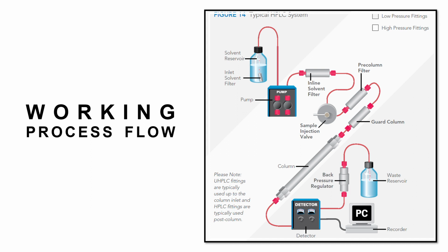The sample injector then introduces a standard solution or sample solution into the mobile phase. Temperature fluctuations can affect the separation of the compounds in the column, so the column is placed in a column oven to keep the temperature constant. Compounds eluted from the column are detected by a detector placed downstream of the column. The workstation processes the signal from the detector to obtain a chromatogram to identify and quantify the compounds. Now we will see how separation occurs with the help of HPLC.